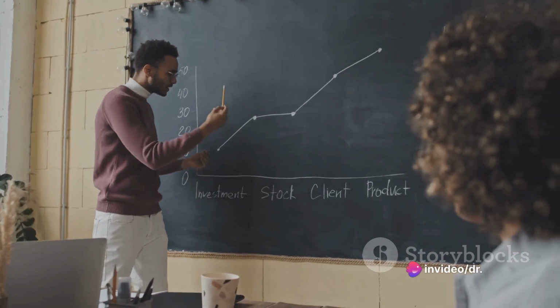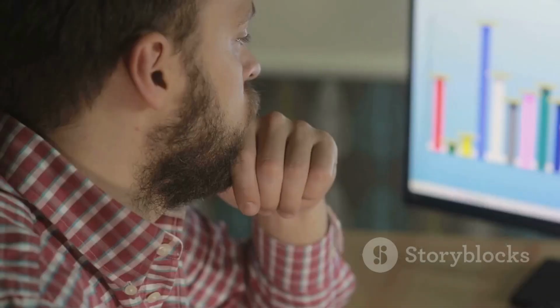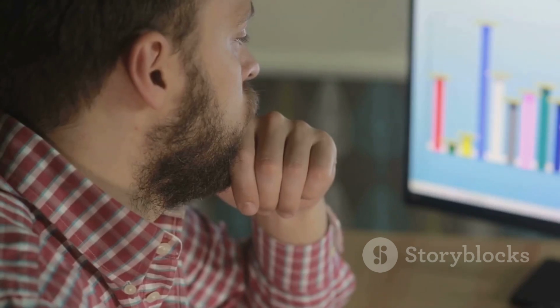Remember, practice makes perfect. So don't be discouraged if you don't get it right the first time. Keep experimenting with different graph types and fitting models, and soon you'll be an Origin Pro expert.